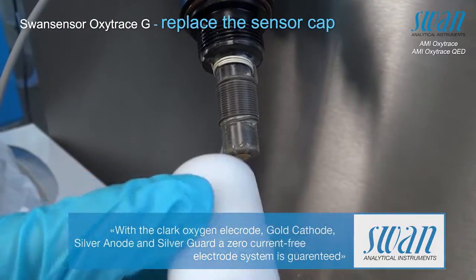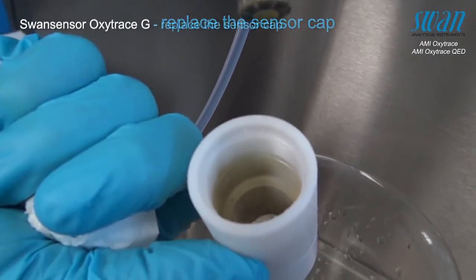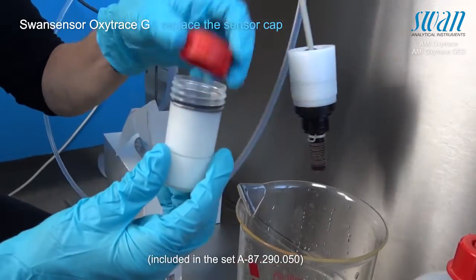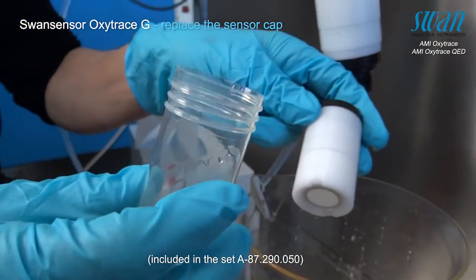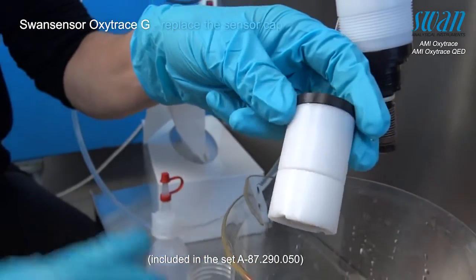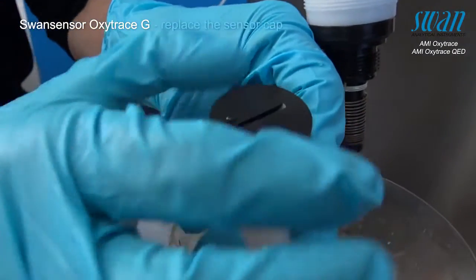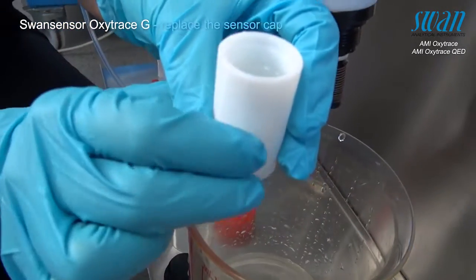If the sensor cap is defective, dirty, or enlarged, the calibration cannot be performed successfully. In this case, the sensor cap has to be exchanged. This can be done by simply taking out the new sensor cap from its container. The benefit is that the membrane itself does not need to be exchanged, as it has already been integrated inside the new cap.